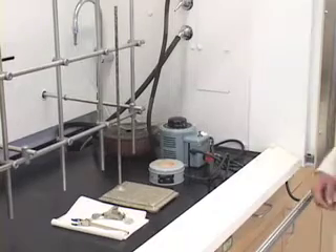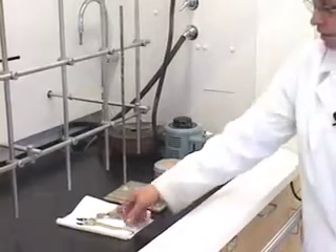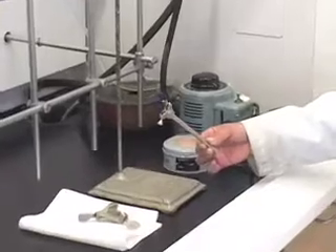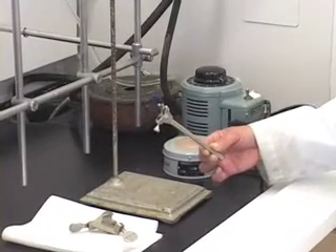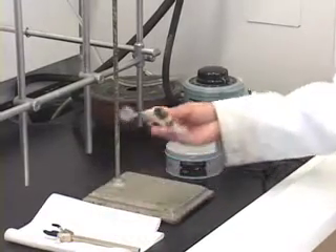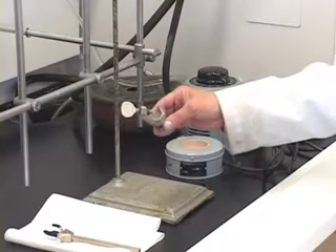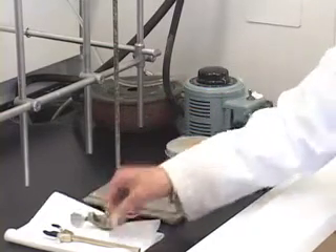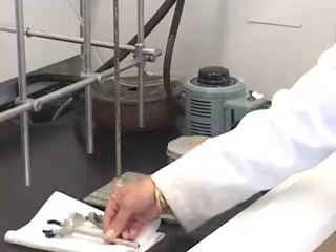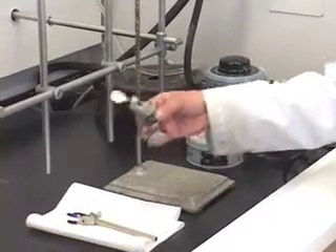The next thing we need is a ring stand, which you have all used before, and we need the clamp. Use the small clamp because we are using a 50 milliliter flask. If you are using a larger flask then you can use a larger clamp. However, please use the heavier clamp fastener — do not use the clamp fastener that comes with the small clamp provided to you. So let us attach this clamp to the ring stand using this fastener.